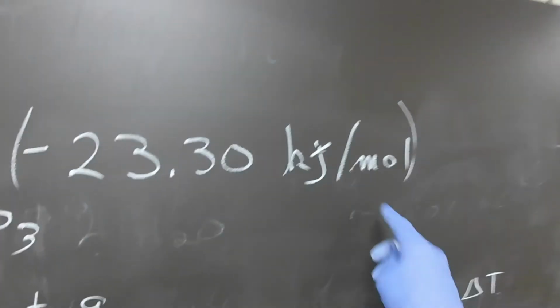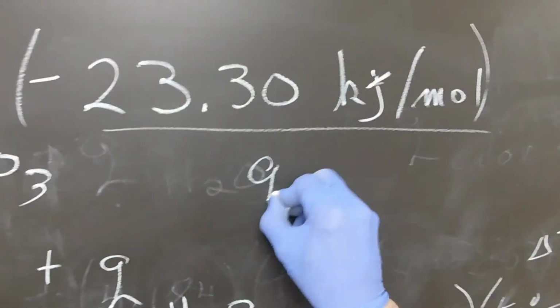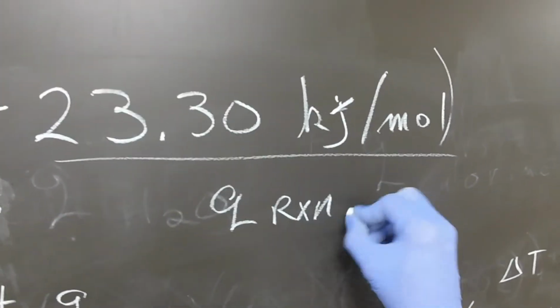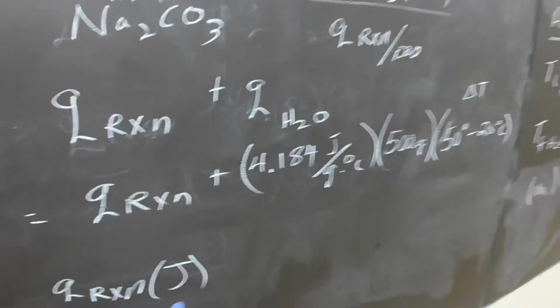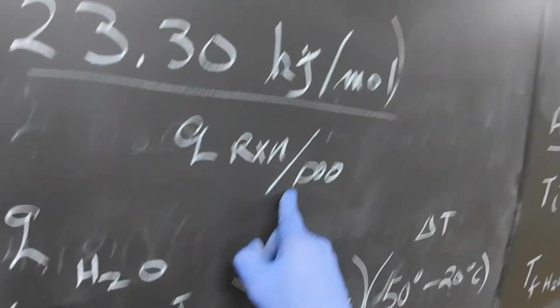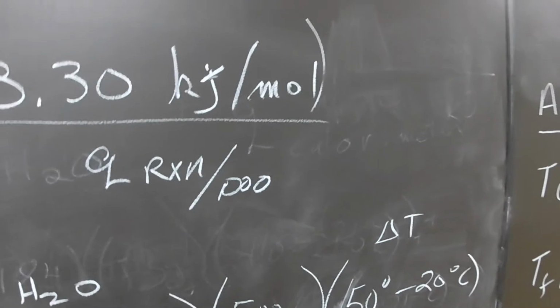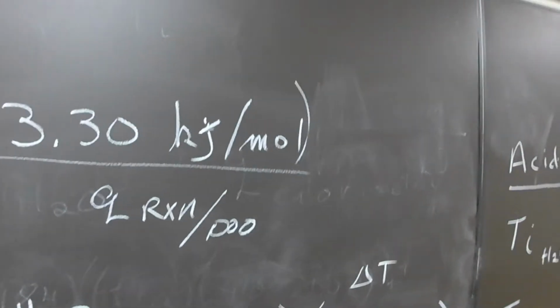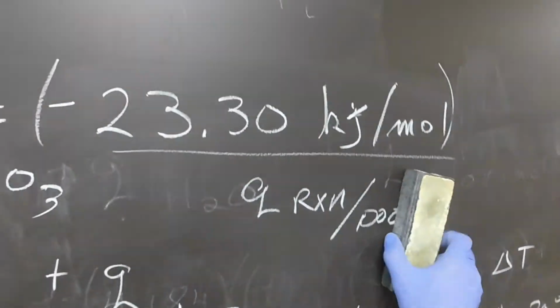Actually, it should be the other way around, because you want moles of sodium carbonate.